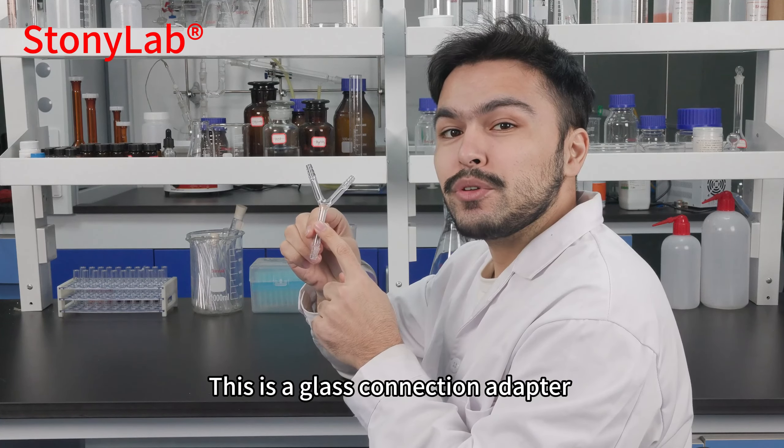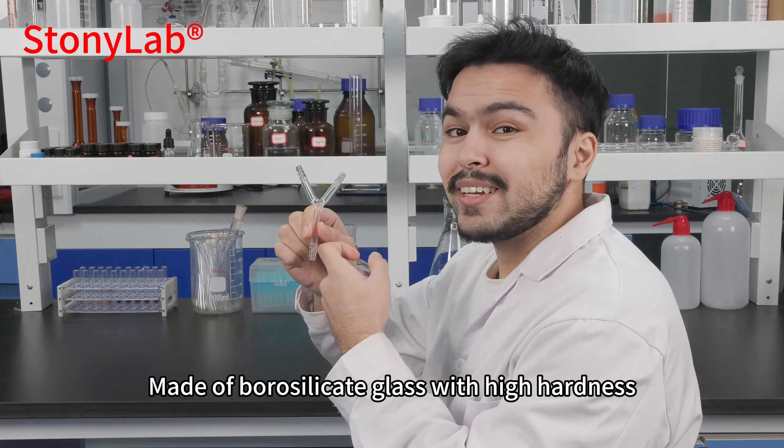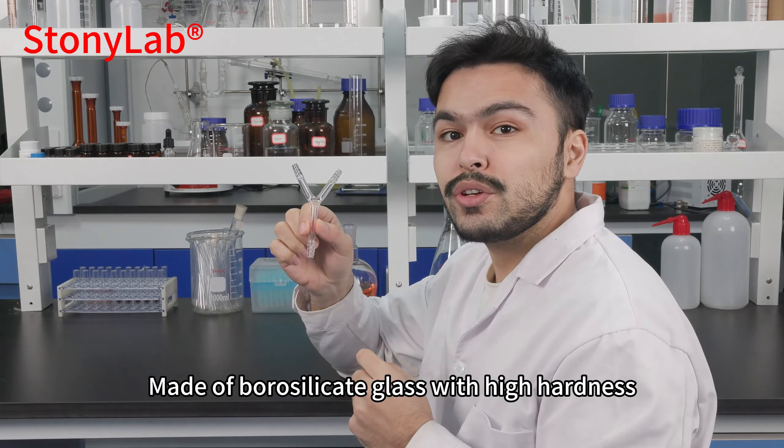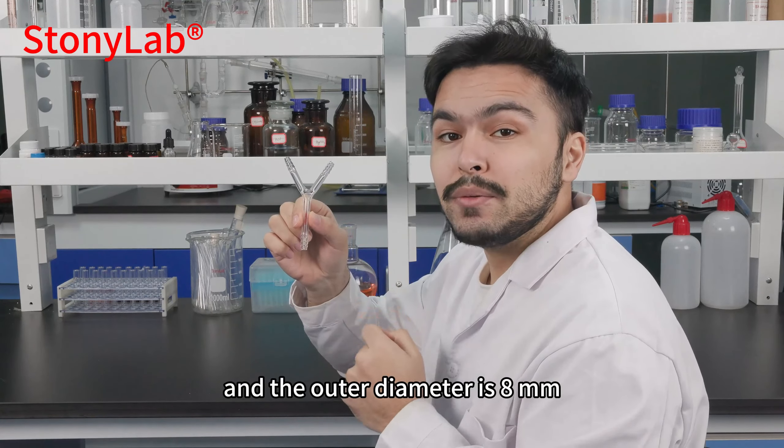This is a glass connection adapter, suitable for controlling gas flow, made of borosilicate glass with high hardness. The inner diameter is 5 mm and the outer diameter is 8 mm.